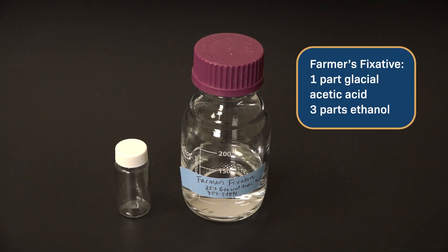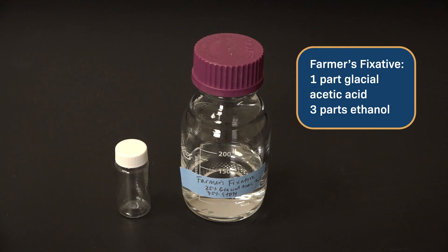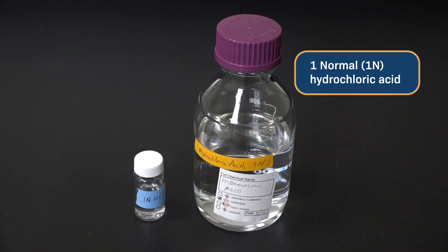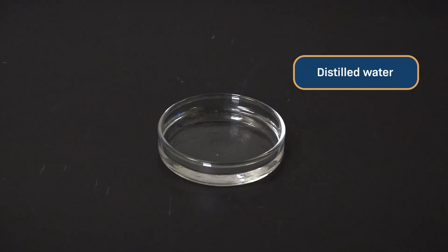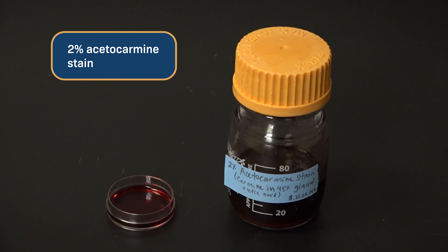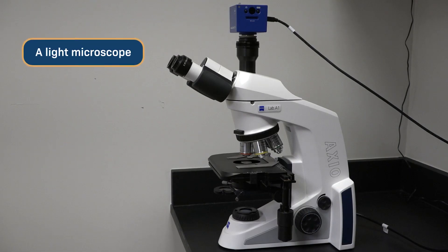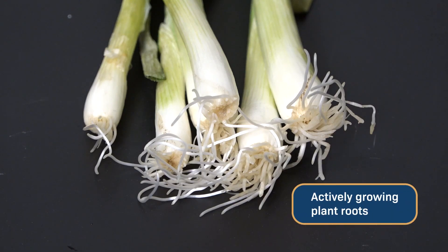Okay, let's start the experiment. You'll need a vial of Farmer's fixative - that's one part glacial acetic acid, three parts ethanol - scissors, forceps and scalpels, a vial of one normal hydrochloric acid, a dish of distilled water, a dish of two percent acetocarmine stain, microscope slides and cover slips, a light microscope, and actively growing plant roots.